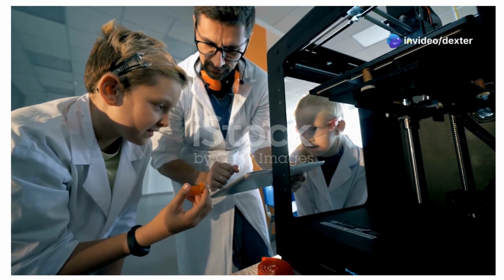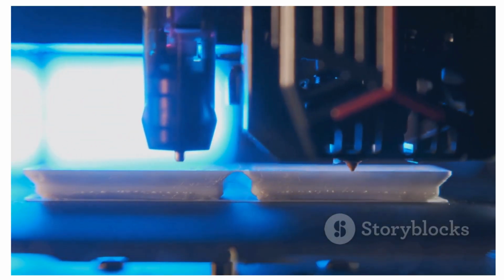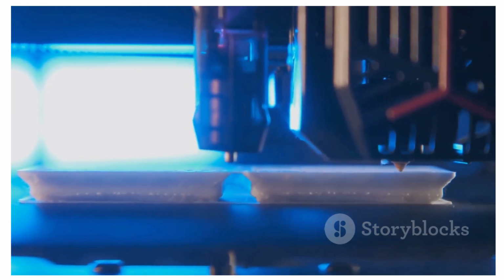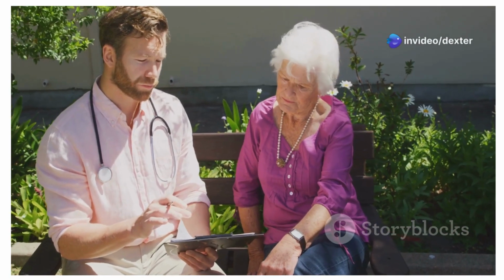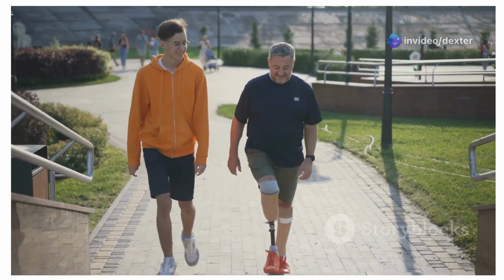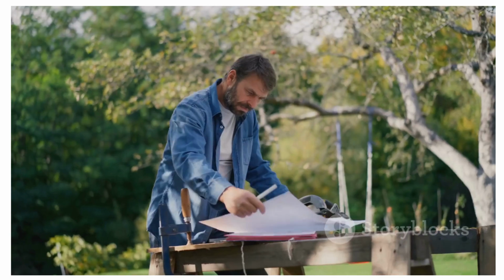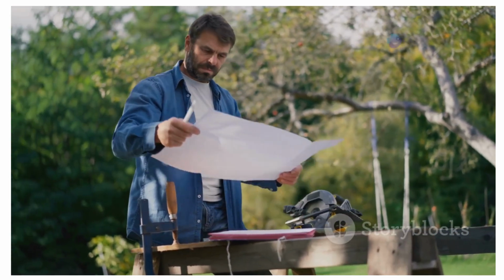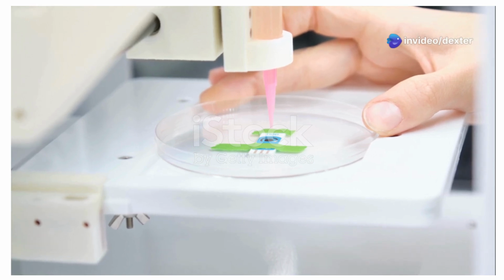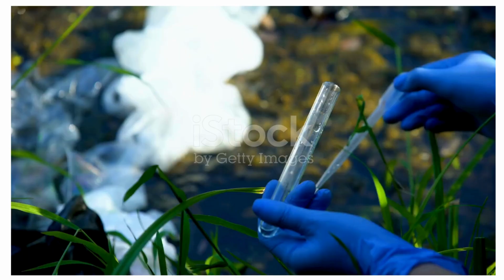Imagine a printer that uses living cells instead of ink. This is what bioprinting is. It's like three-dimensional printing, but instead of plastic, it builds tissues and organs using cells. This technology has the potential to revolutionize medicine. It could help people who need organ transplants or create new tissues to repair injuries. Bioprinting is a complex process. It involves creating a blueprint of the organ or tissue we want to build. Then we use a special printer to layer living cells onto a scaffold. This scaffold acts as a support structure for the cells to grow and multiply.